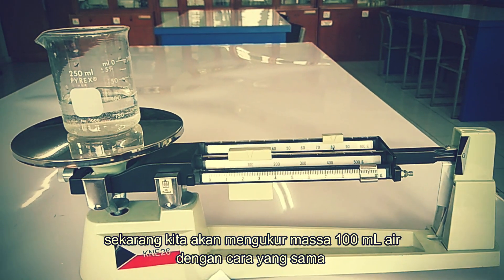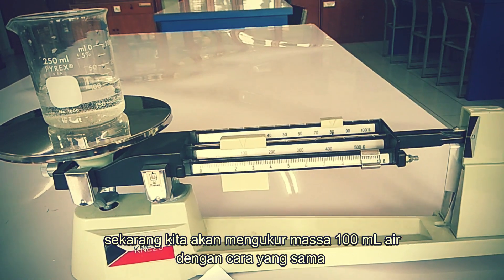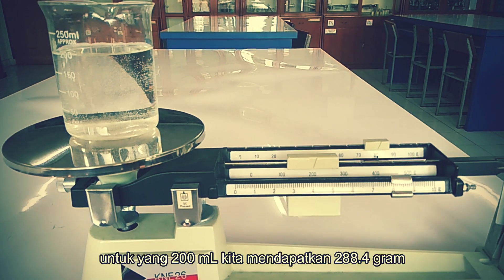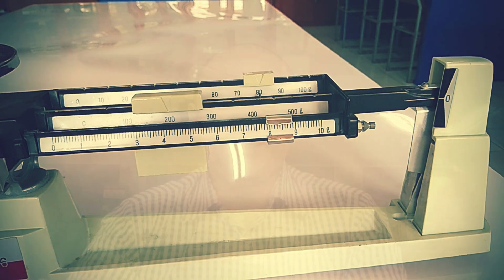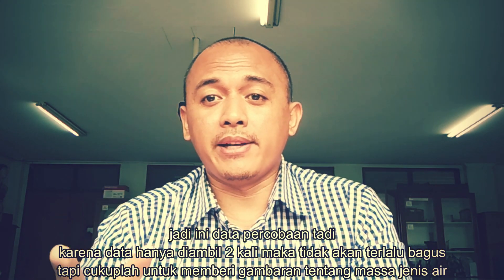Now we will measure the mass of 100 ml of water with the same beaker. We got 189.5 grams. And for 200 ml of water we got 288.4 grams.